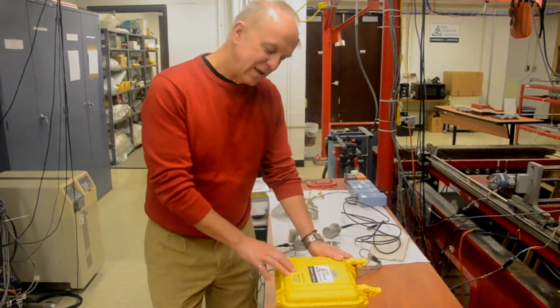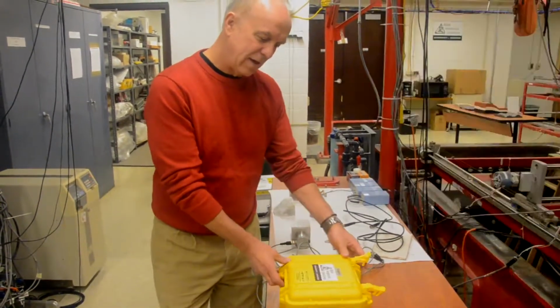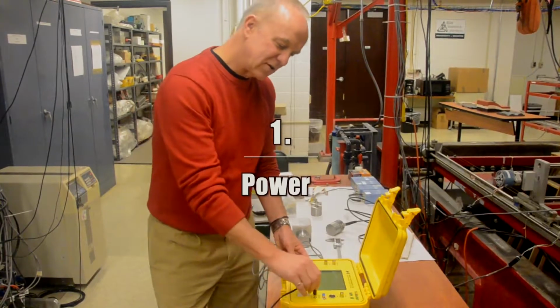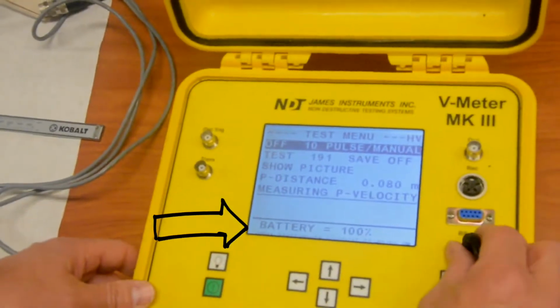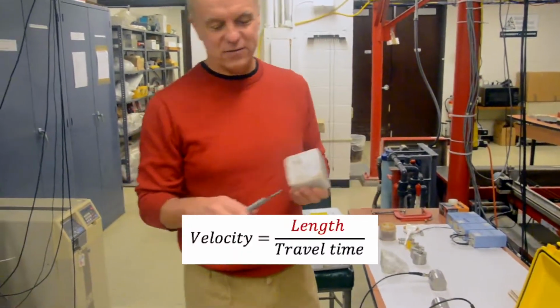So we're using the James Instruments V-Meter, and here we have our V-Meter. The first thing we want to do is make sure that the battery is charged, as always. So we have our battery cable. Sure enough, our battery is at 100%. So wonderful. Well, we've got to get the length or the distance of the rock.